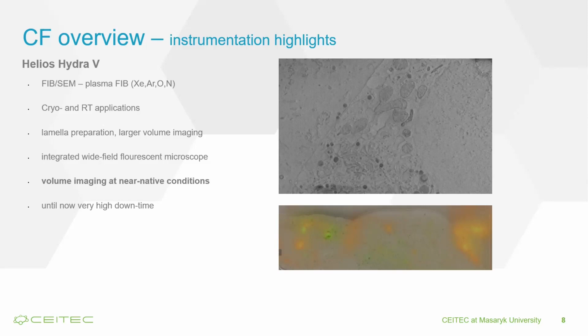The quality of the imaging that we get, as you can see in this image of mitochondria where you can even see the double-layer membrane, is so good that we can reconstruct whole cells at the ultrastructural level from the data. And that, to me, is stunning.